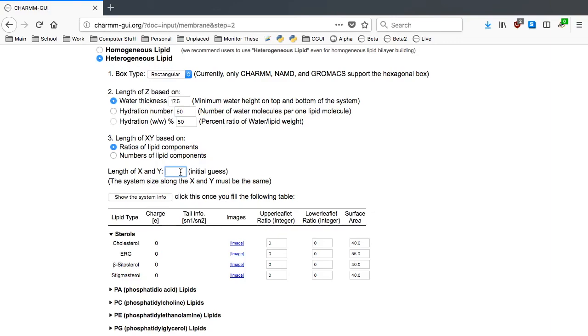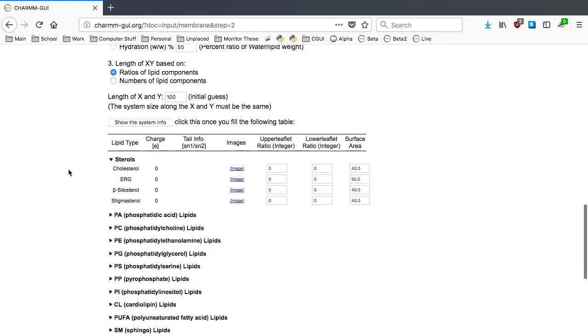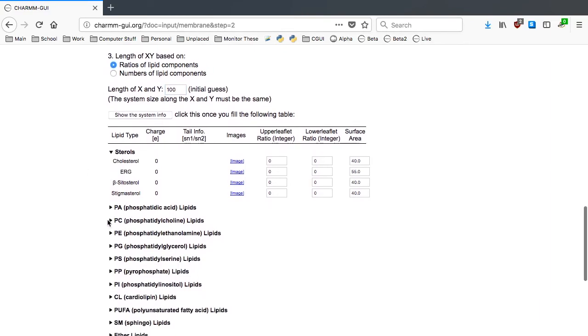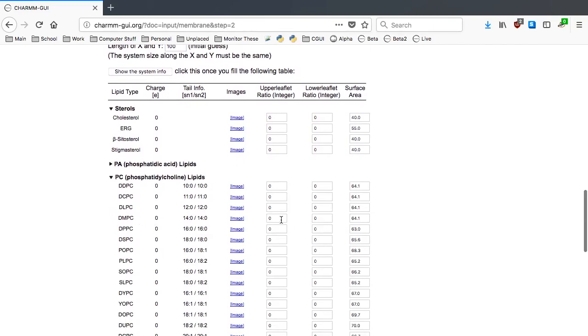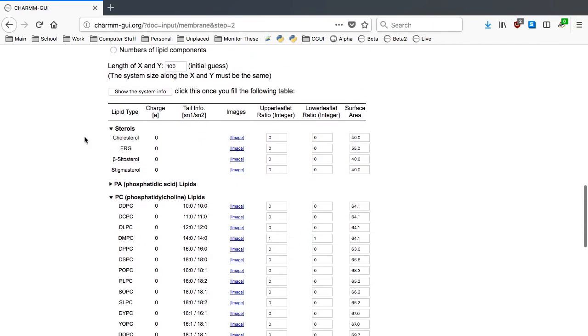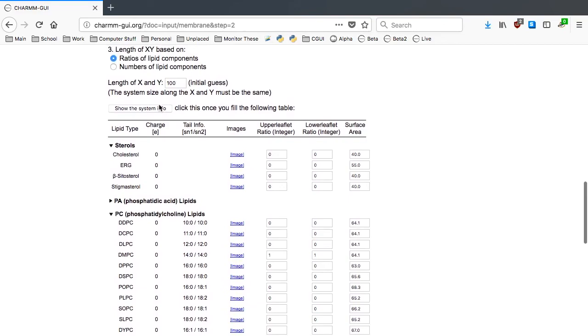In this example, we will build a simple bilayer using DMPC as the only lipid type. Let's first try 100 for the XY length, and type 1 and 1 for the upper and lower leaflet ratios in DMPC under PC lipids. Then show the system info.